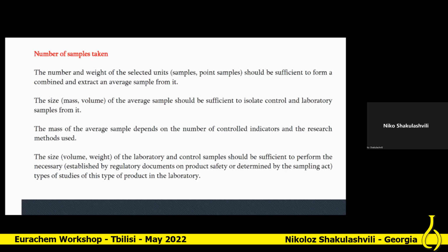When it comes to the size of the laboratory sample and control sample, this size should be sufficient to carry out accurate tests in the laboratory, whether by chromatographic method or other.